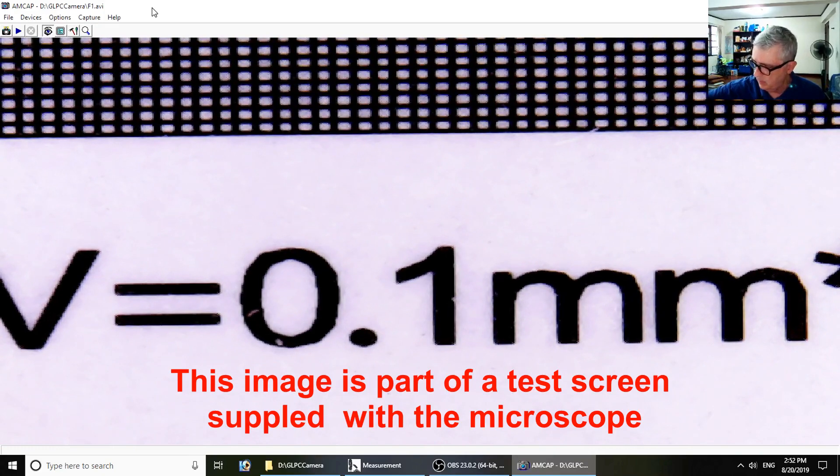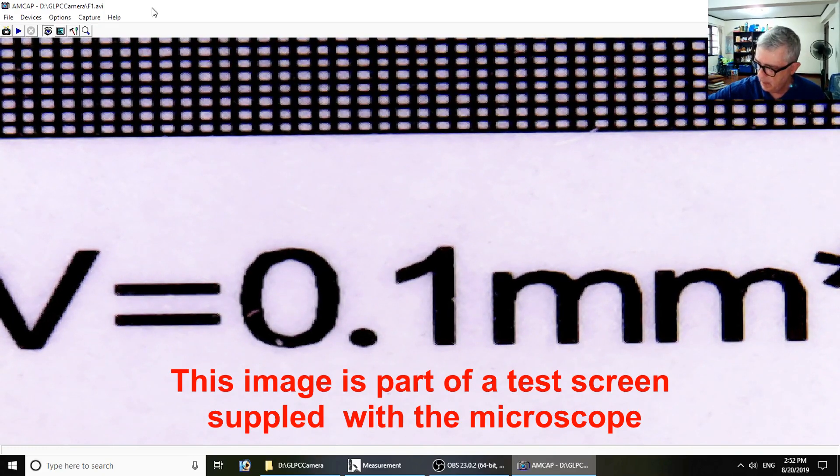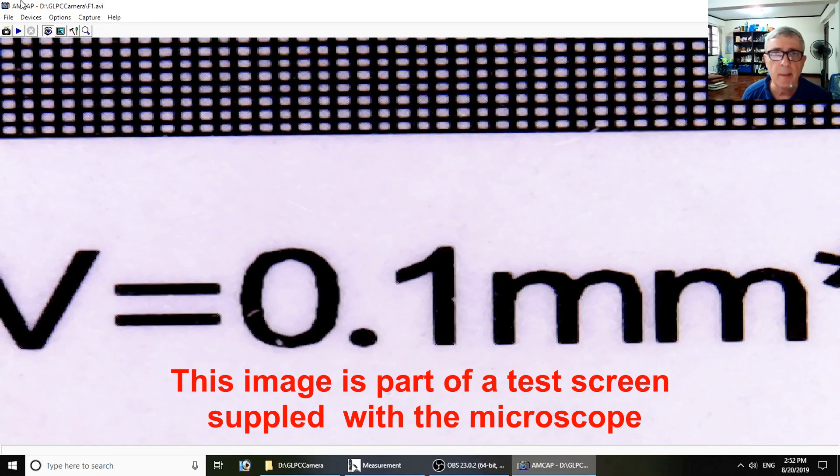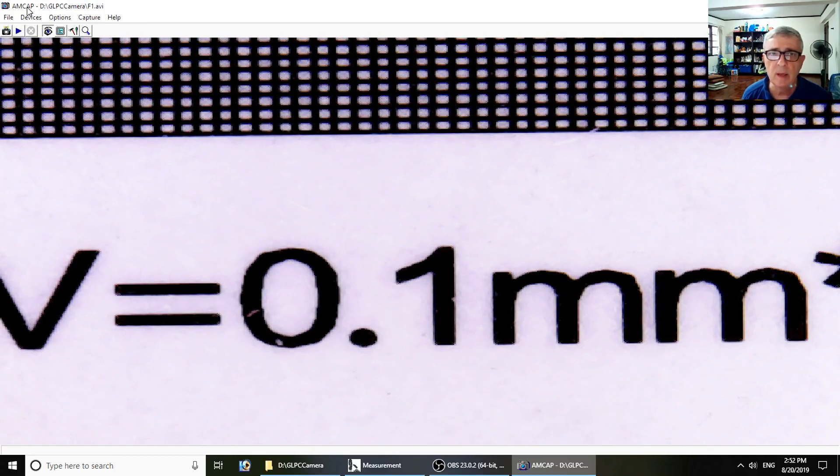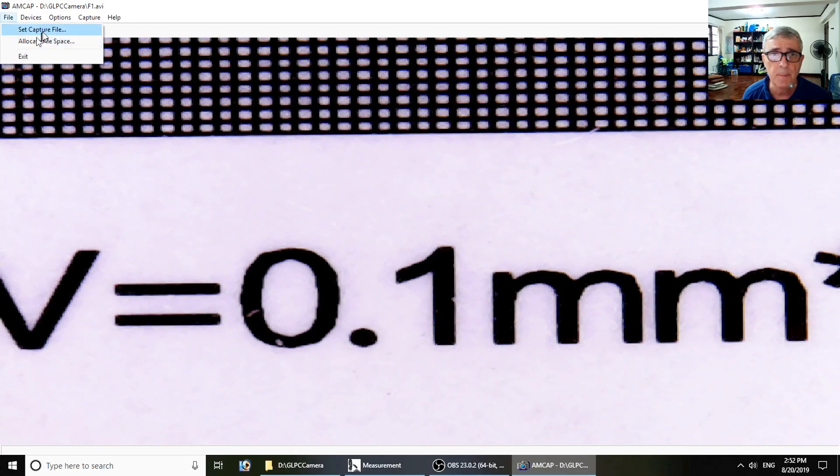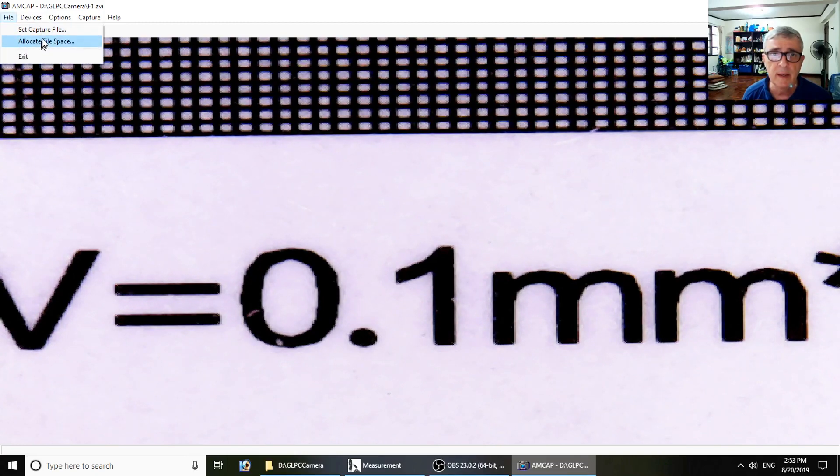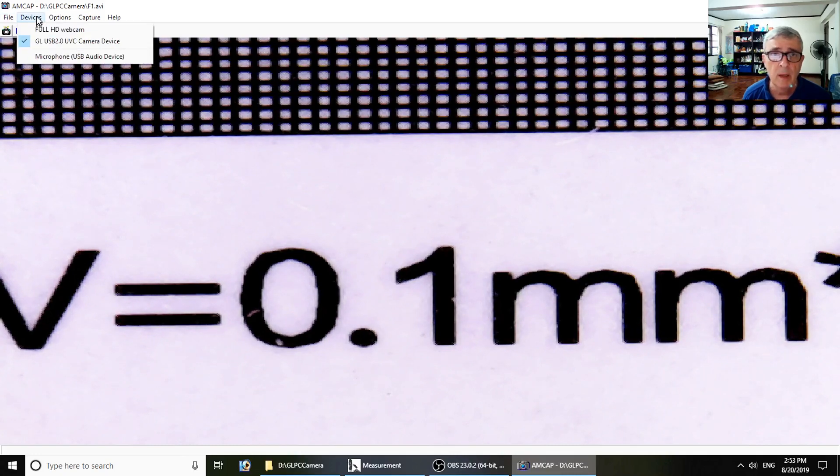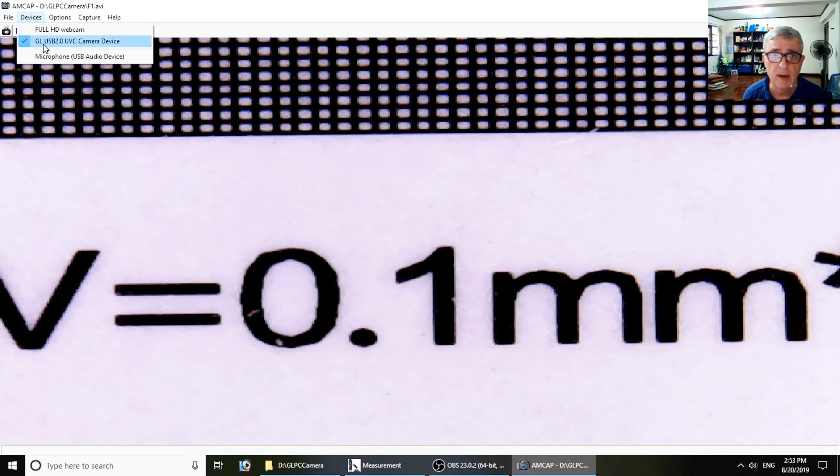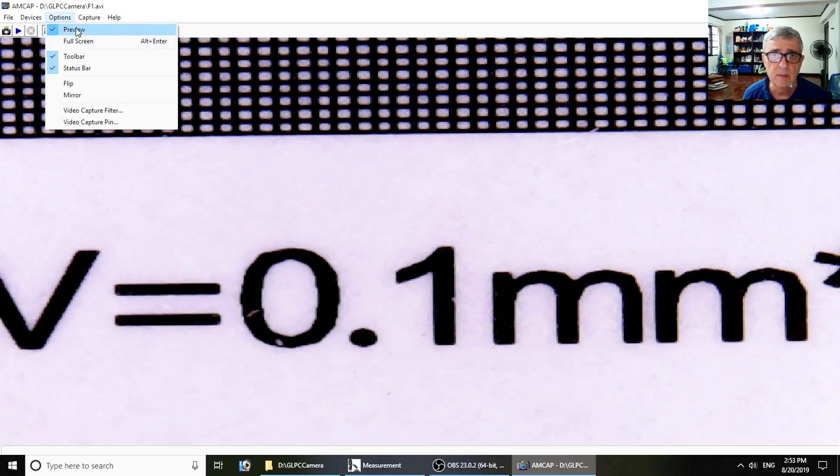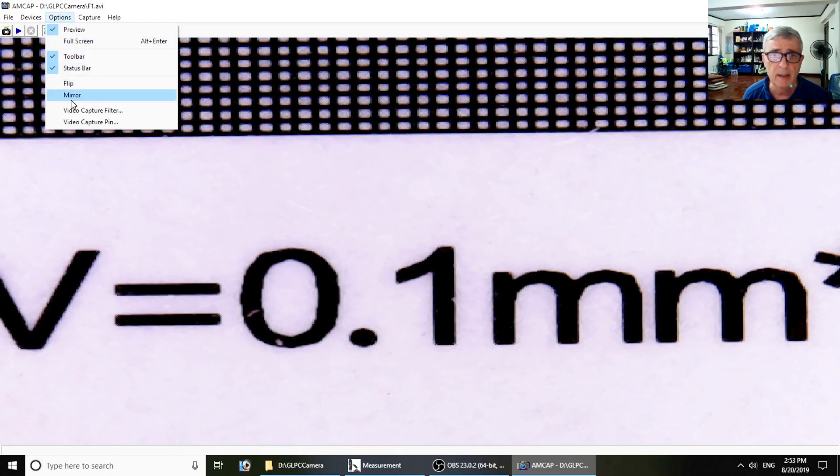The first thing is what they call AM Cap, and it's what allows the microscope to operate. Very simple software. These are for setting file space for videos, the devices you can select. Obviously we're using the microscope. The options - this is what's on the toolbar. Flip, mirror - these are obvious.